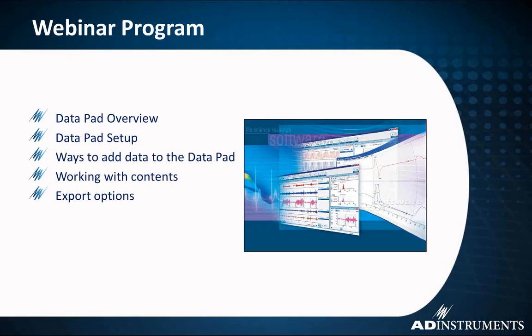We're going through different ways of extracting that data from the chart view in its graphical form into its numerical form in the DataPad. And then once we have the data in the DataPad, working with it to perform calculations as well. And then finally, we'll be finishing up with the different options for exporting the data into other programs for further analyses as well. Okay, so we're going to go straight into LabChart now.